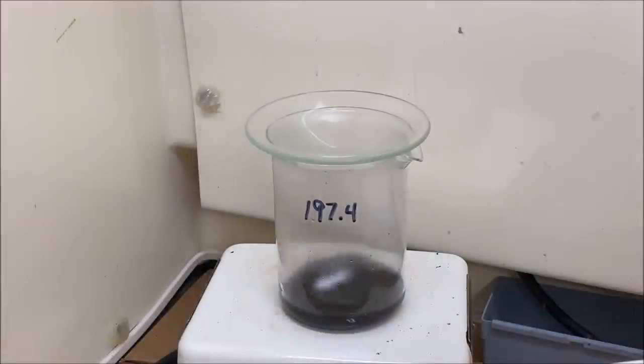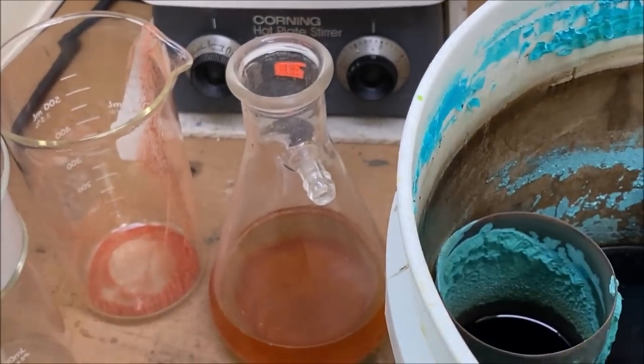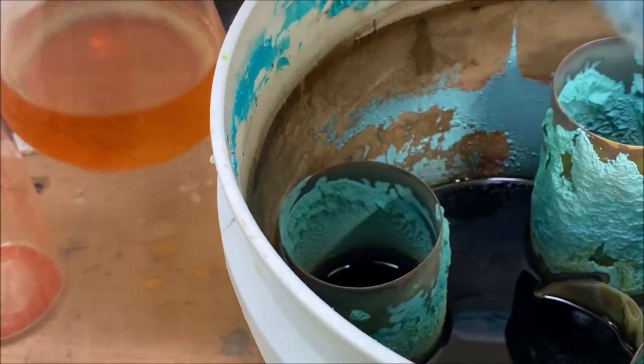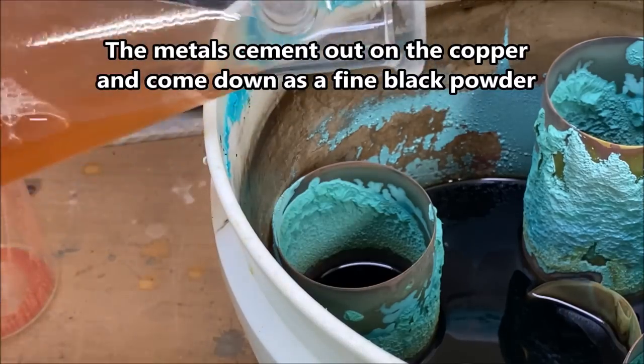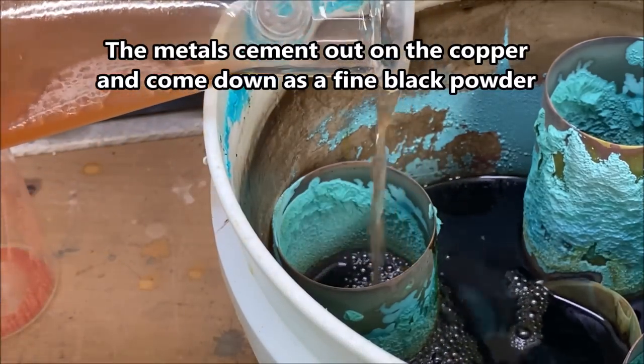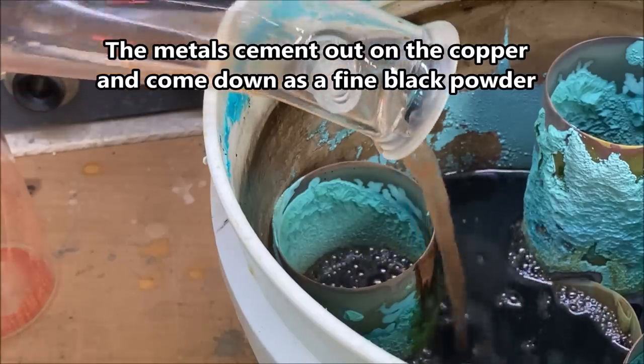While I'm waiting for the platinum to boil in that hydrochloric acid, I think what we'll do is get busy doing the dishes here. From yesterday's procedure, this is our waste solution. Just gonna add it right on into the stock pot. What will happen in here is the metals will cement out on that copper that's in there.